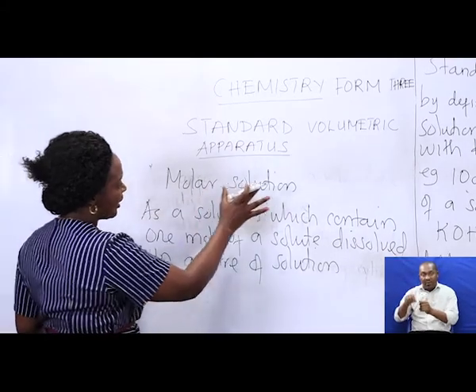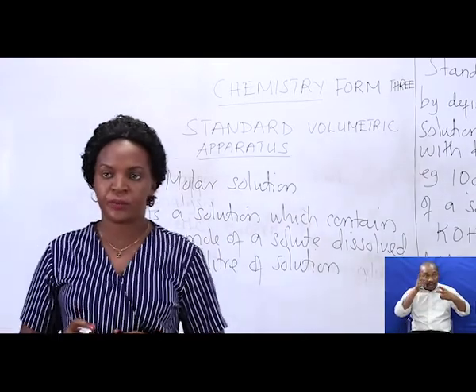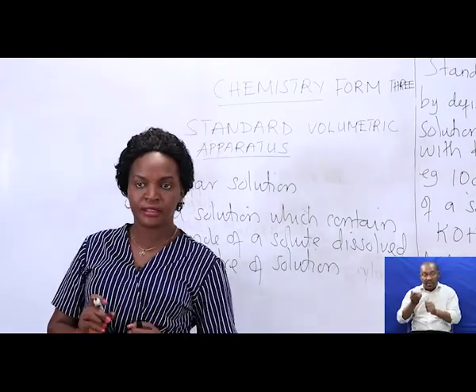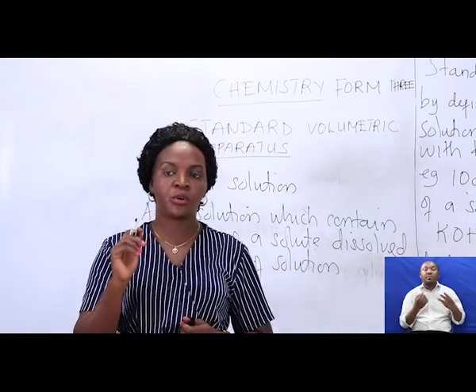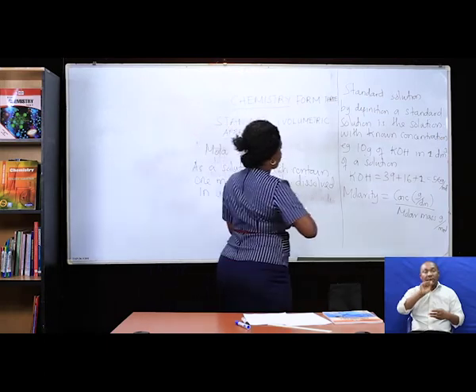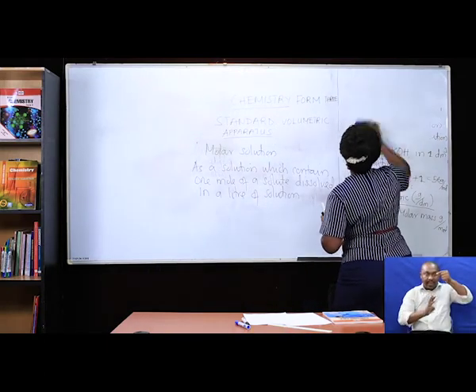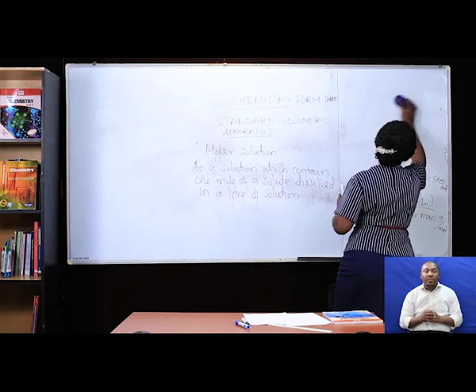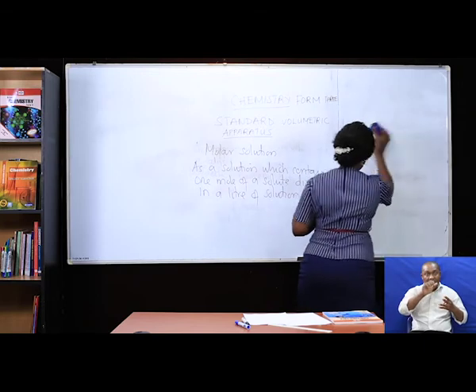Then after understanding these terms, we have another thing that we need to know. We need to know what we call titration. So what is titration? And then what is acid-base titration?